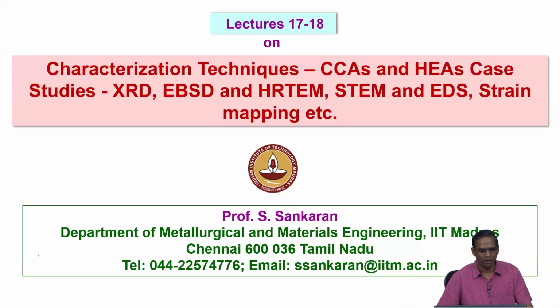Yeah. So we start with X-ray diffraction for crystallographic identification or phase identification, optical microscopy for overall microstructures at very low magnification.